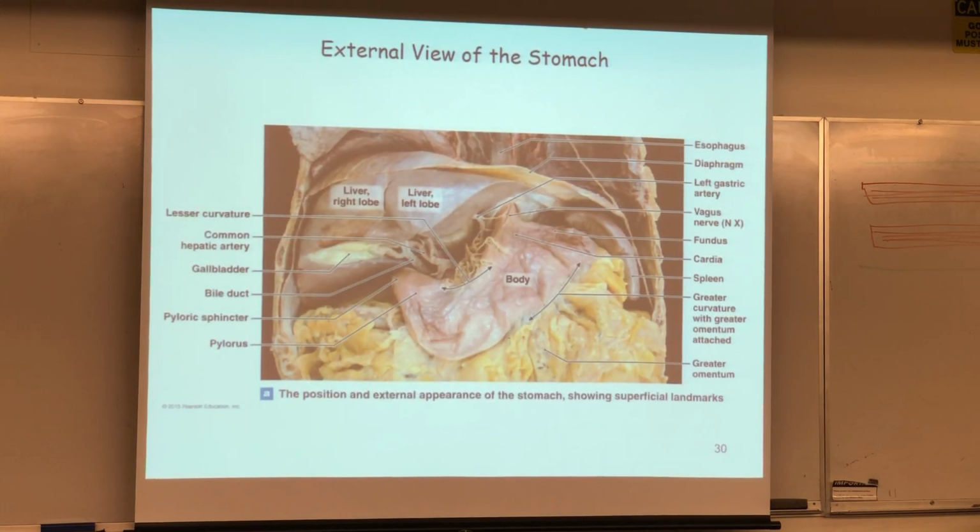All right. This is just a photograph because you guys are going to be looking at kitties later this week, if not next week, just to really get a hands-on feeling of the digestive tract.